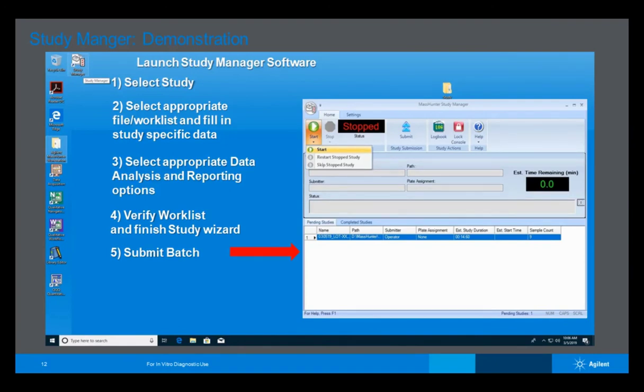But a colleague of yours could actually come and walk through that same wizard that we went through previously and hit submit, and wouldn't have to actually hit start. That's another feature that's included there too. You can configure it so that if it's sitting idle for a long period of time, it can actually go into a standby position.